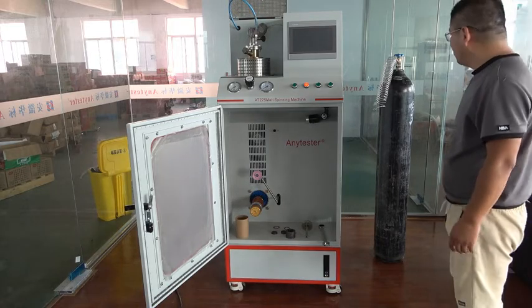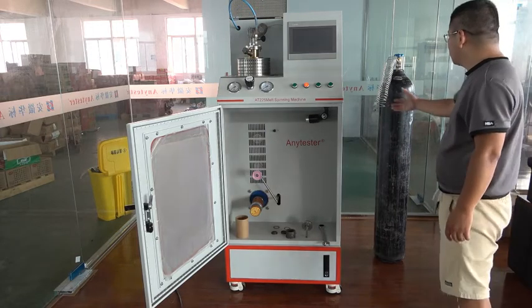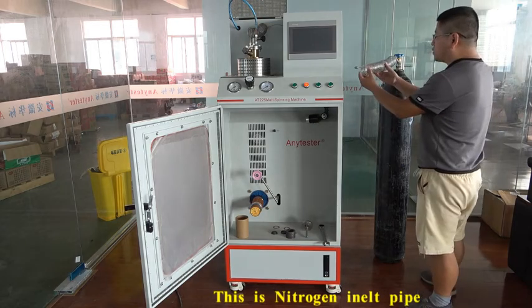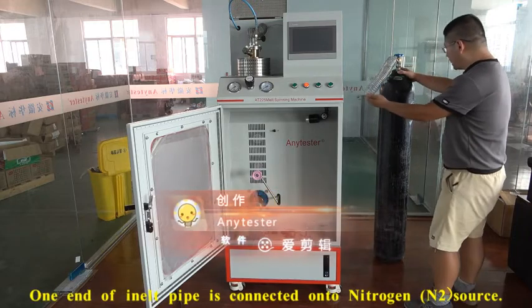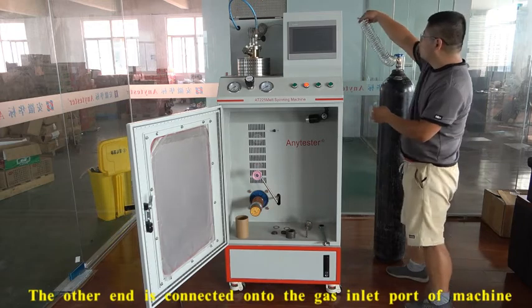This machine is equipped with several accessories. This is the nitrogen inlet pipe, one end connected to the nitrogen cylinder, the other end connected onto the machine.